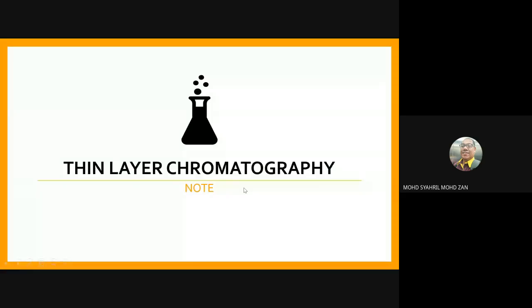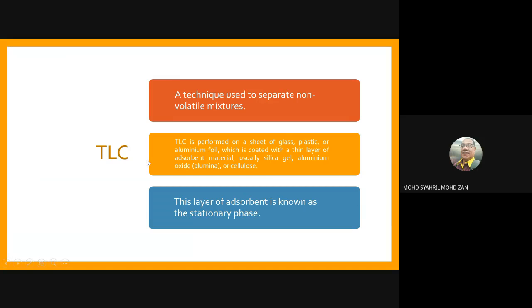Alright, TLC chromatography continues. This one is a note, available in your course content under our lab today, TLC. What is TLC? TLC is a technique used to separate non-volatile mixtures. Something that is not volatile can be separated using this technique.